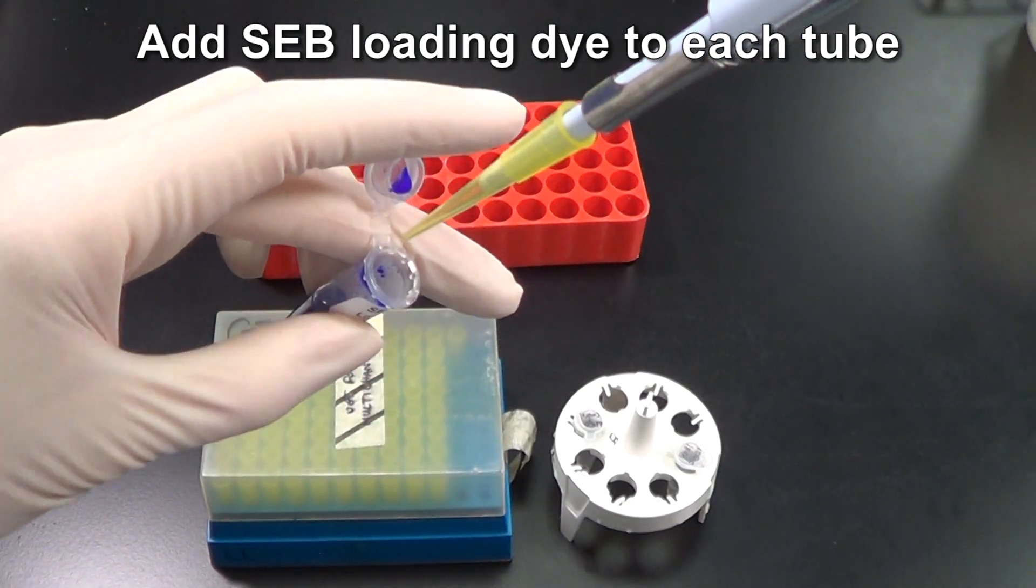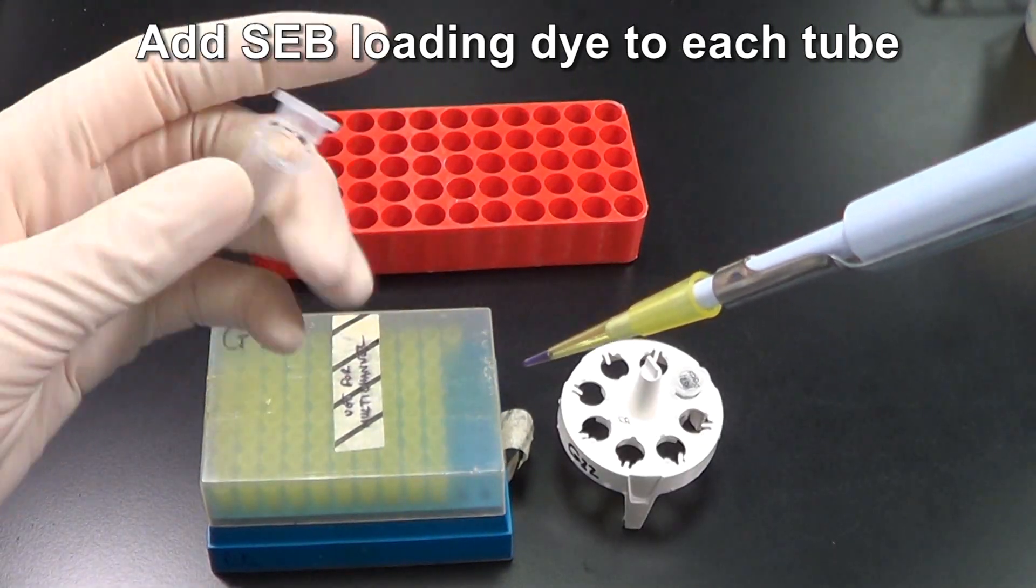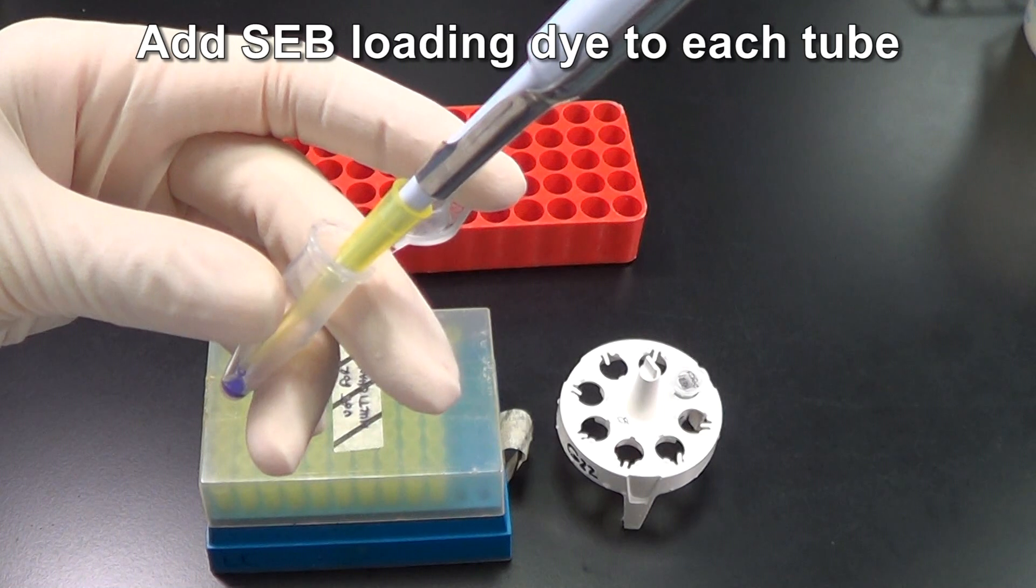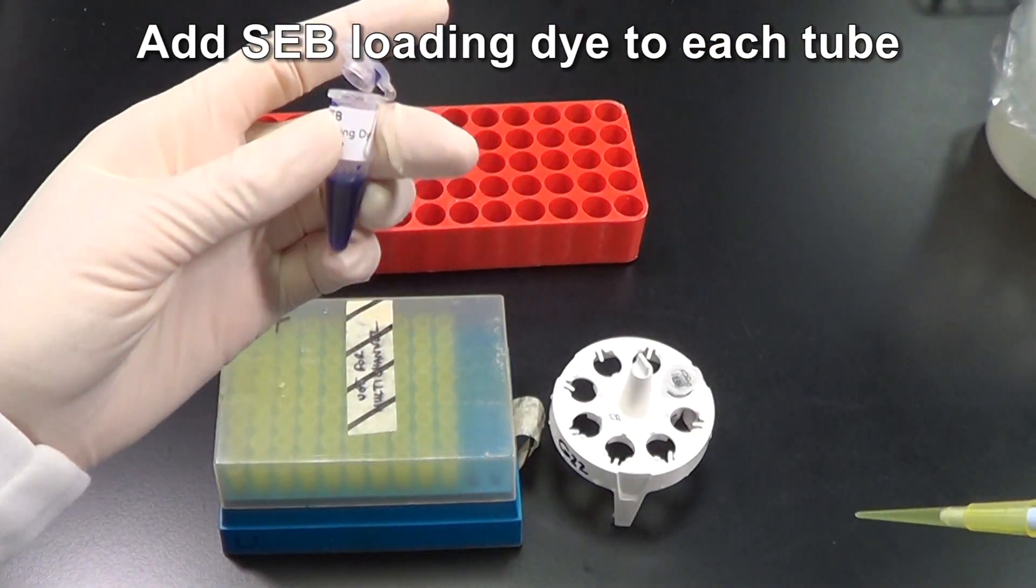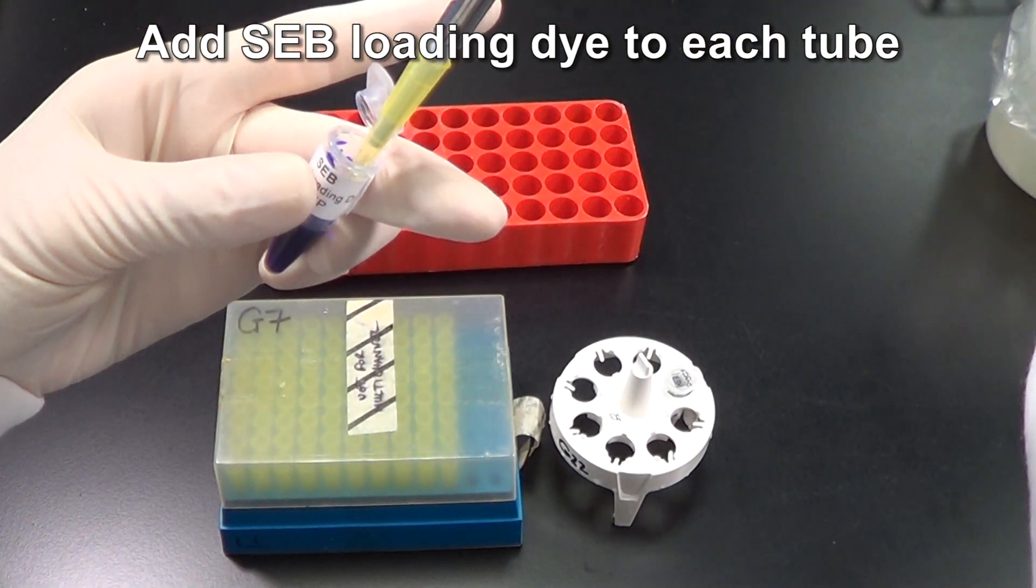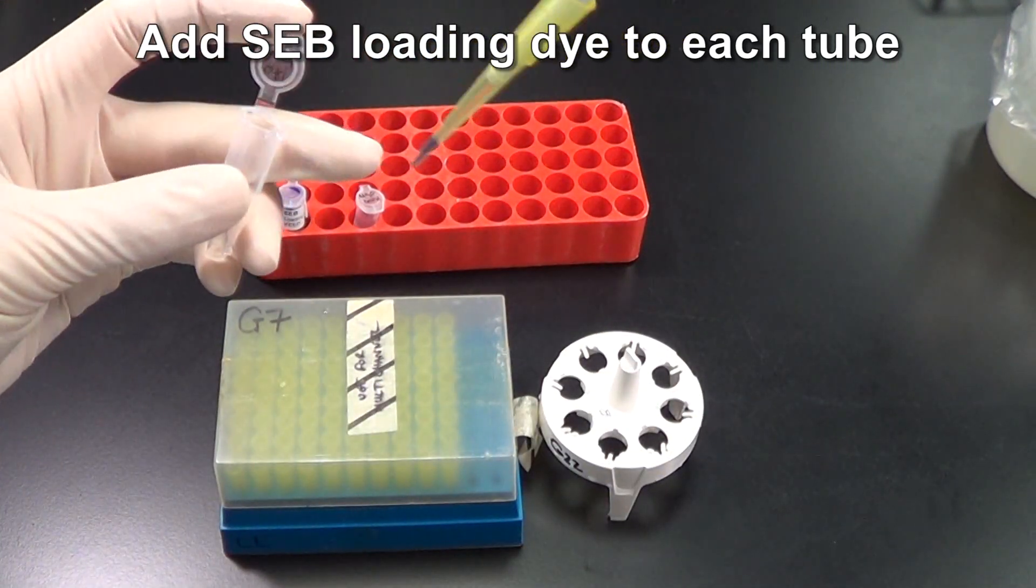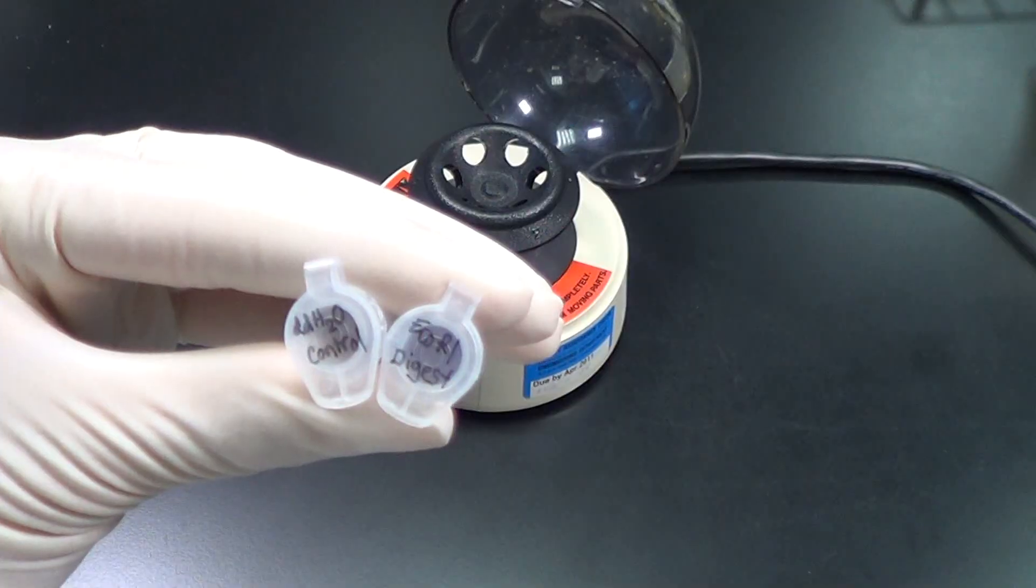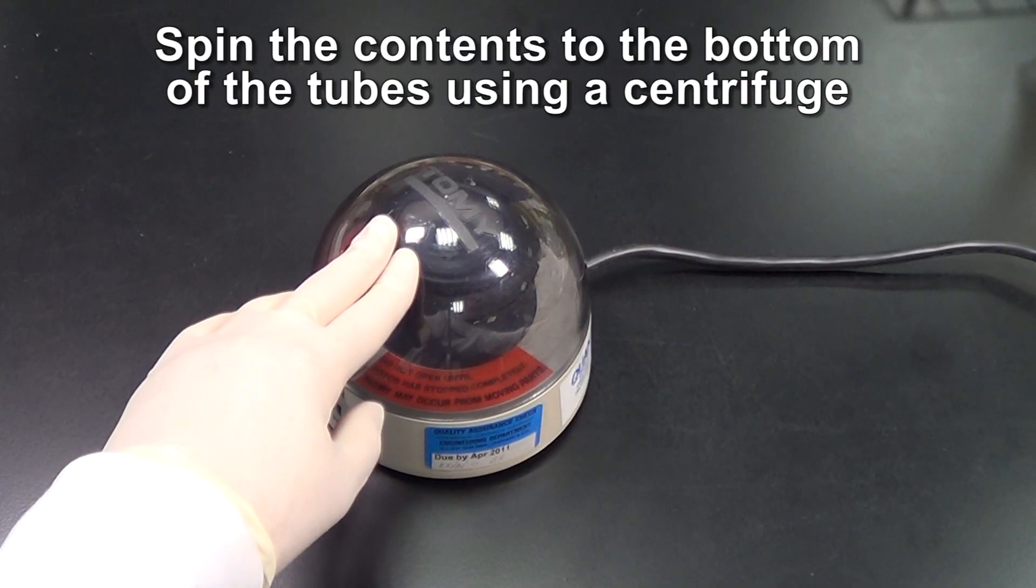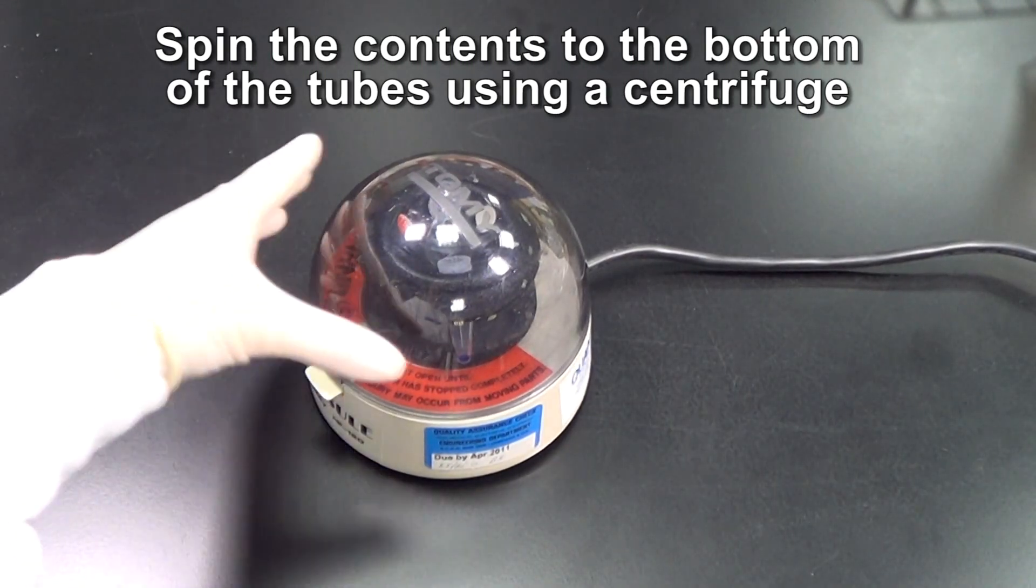Add SEB loading dye to each tube. Collect the contents into the bottom of the tube by centrifugation. Then load the samples onto an agarose gel.